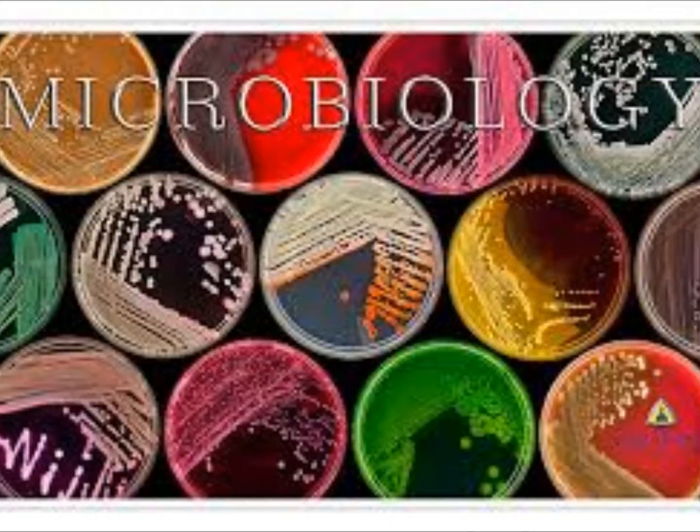Is everybody getting an idea of what we're talking about with pinpoint versus large? Moderate and large seem to be very close. Is it going to be an issue if you call a moderate a large or a large a moderate? No, and these are the 18-hour plates, so tomorrow that large might really look large.